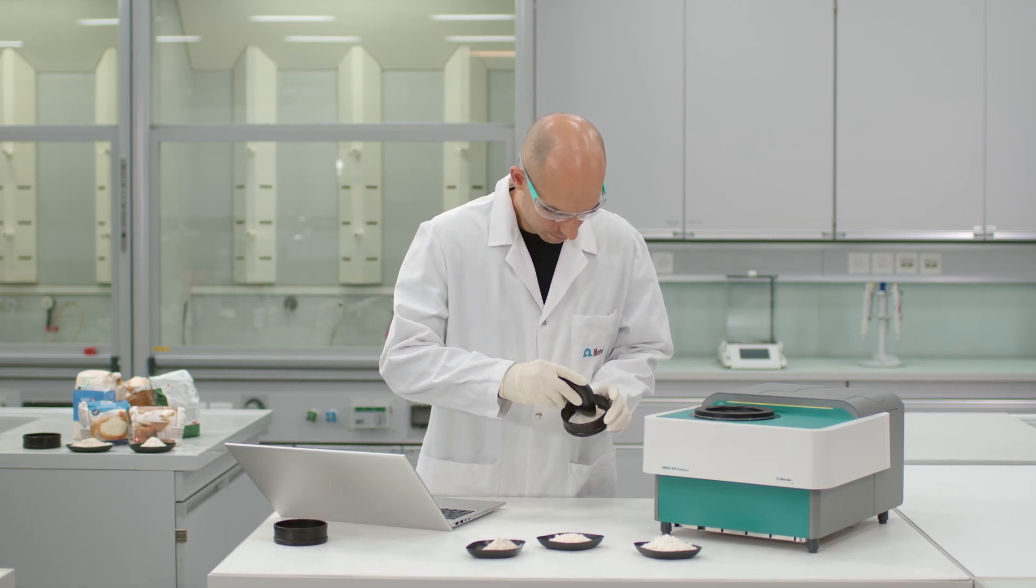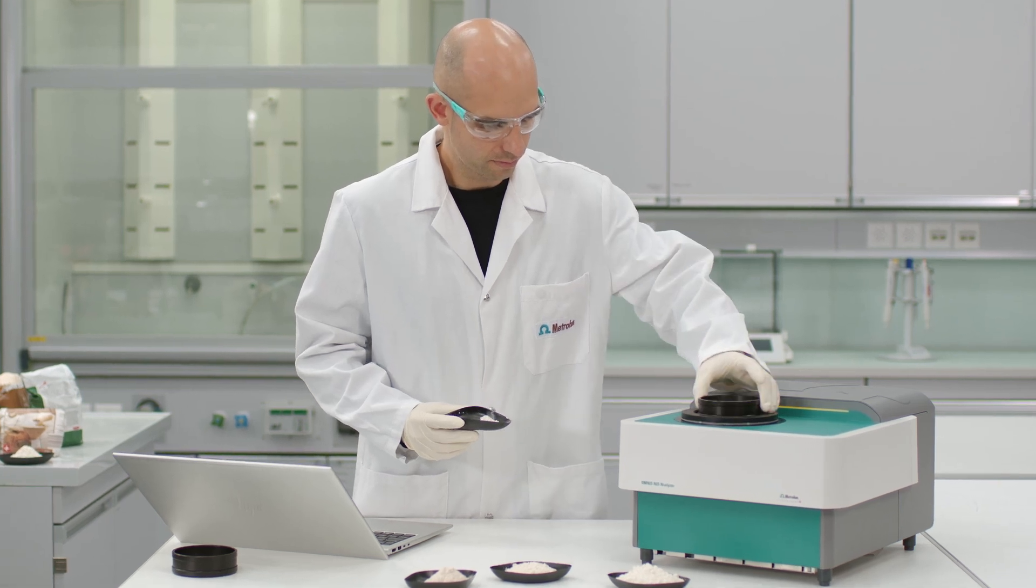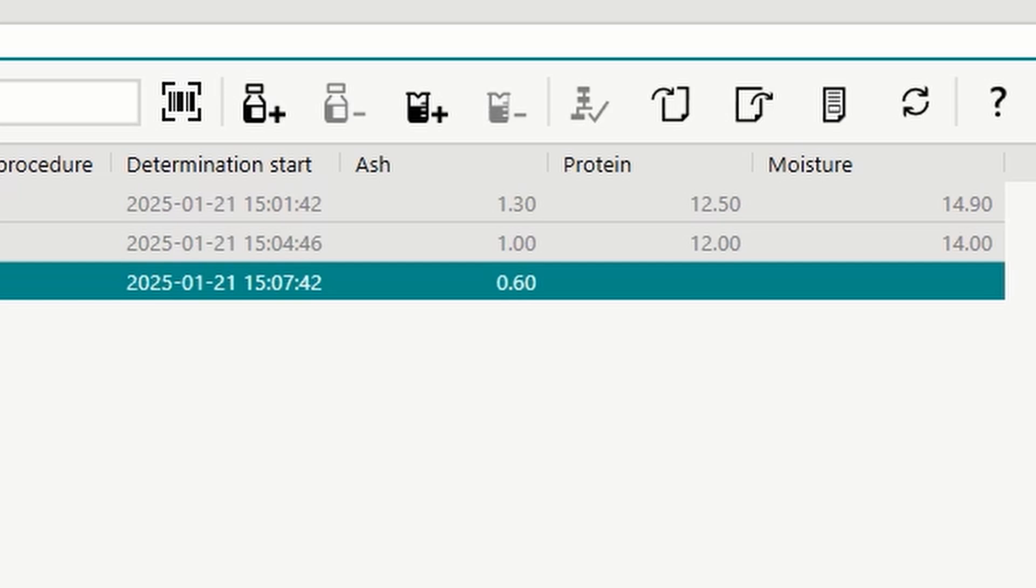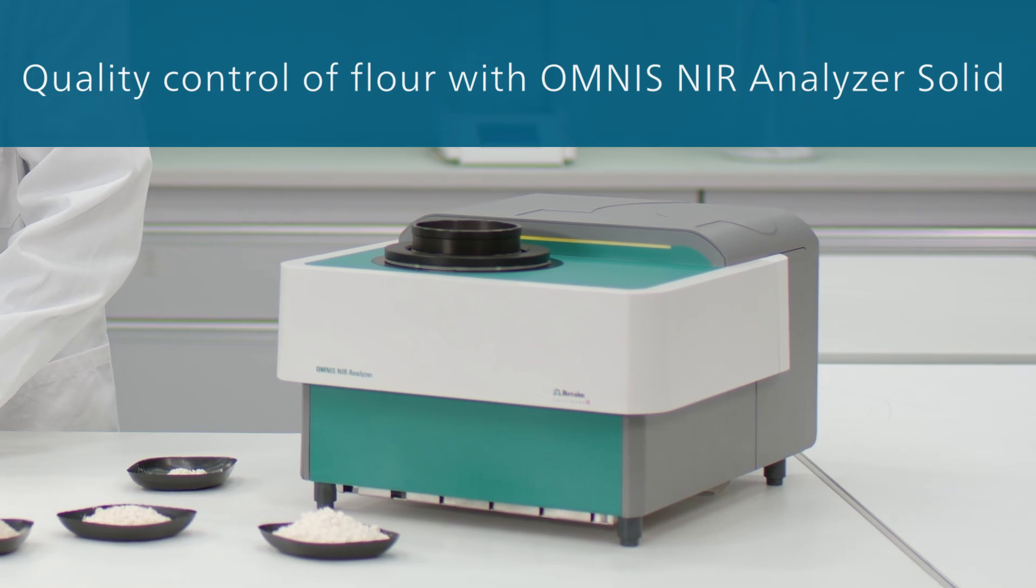It's so fast! Fill the cup with flour, place it on the Omnis near analyzer solid, start the measurement. Get your ash, protein and moisture content in seconds with the Omnis near analyzer solid from Metrum.